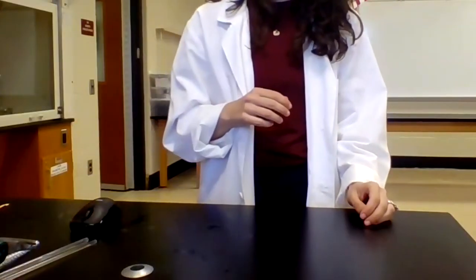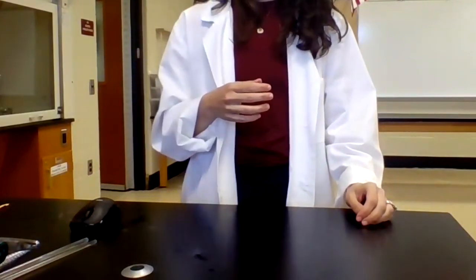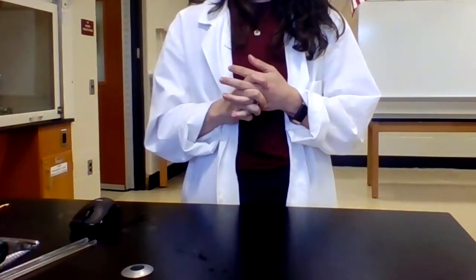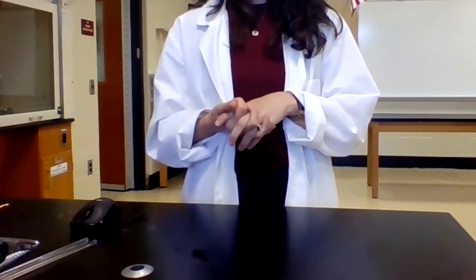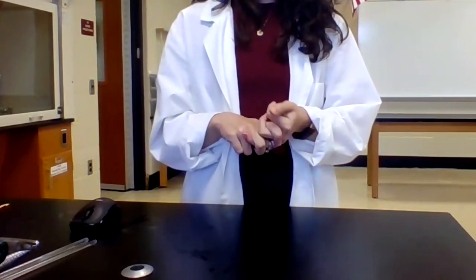So now that we've tested the properties of our 4 solids, we want to clean up and then have a seat and fill out our results table, deciding if the solid is metallic, non-polar covalent, polar covalent, or ionic.